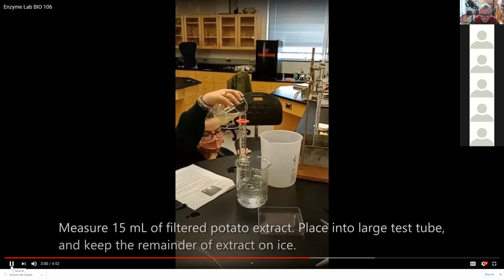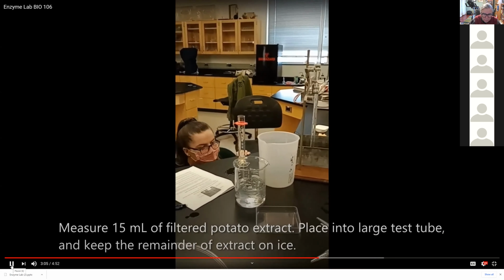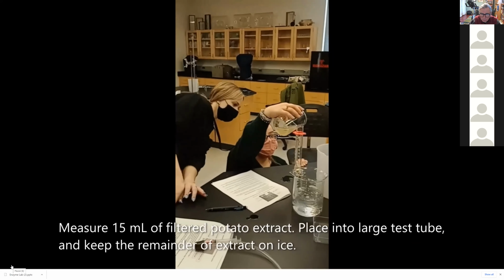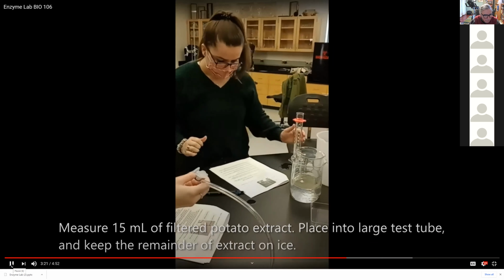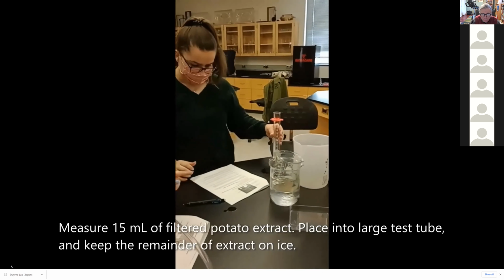Okay, let's continue. So you measure 15 milliliters of potato extract and put it into a reaction tube, which is a large test tube. They got to keep it on ice because it's a protein and bacteria are getting into it and they're gonna chew it up. So the extract you're not using, you got to keep it on ice. Or you should keep it on ice.